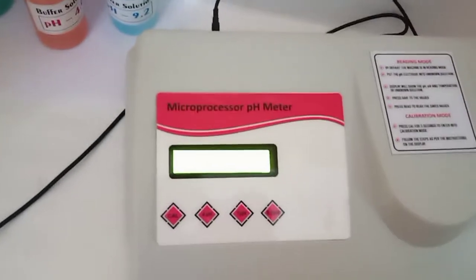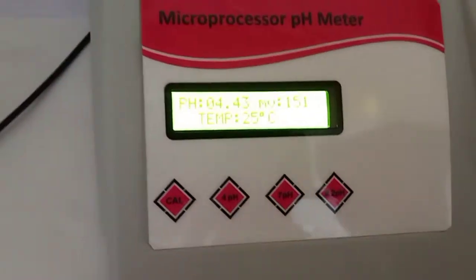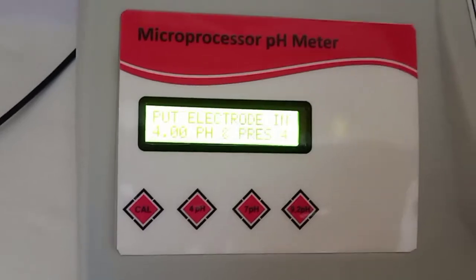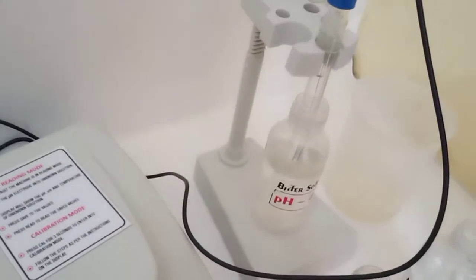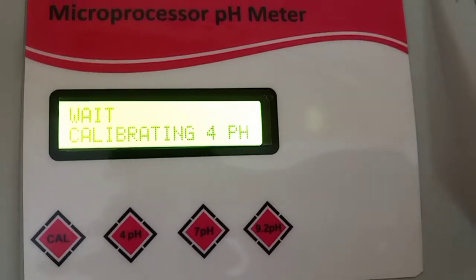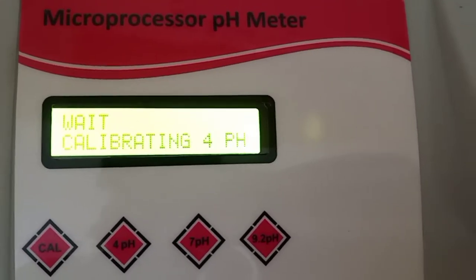After washing, put the electrode into the 4 pH buffer and press the CAL button to start calibration mode. We have already put the electrode into 4 pH and pressed the 4 button — now we have to wait until the calibration process is over.